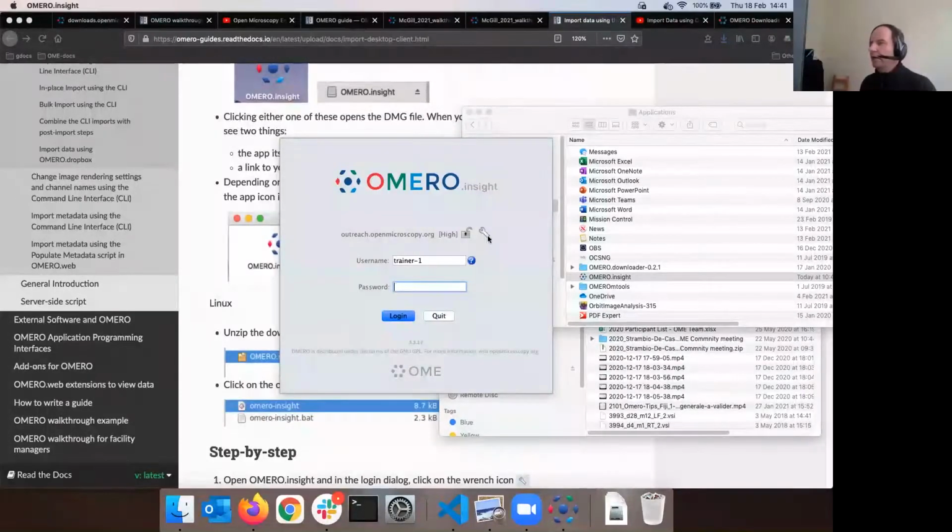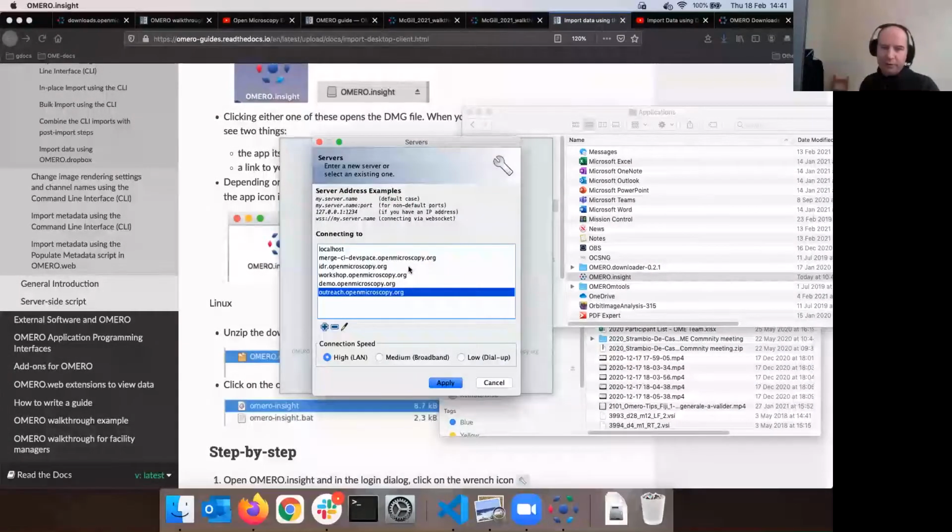I will now ask you again, as we are at this stage, if you are sure about what credentials are yours. By credentials, we mean username and password, okay? Your username will look something like user dash X. The X will be a number between 1 and 50, okay? Michael was so nice to distribute them to you. Are you clear about what your username is? If not, then ask questions, raise your hand or whatever. That's the first thing. But even before we get to username and password, we have to sort out the server.